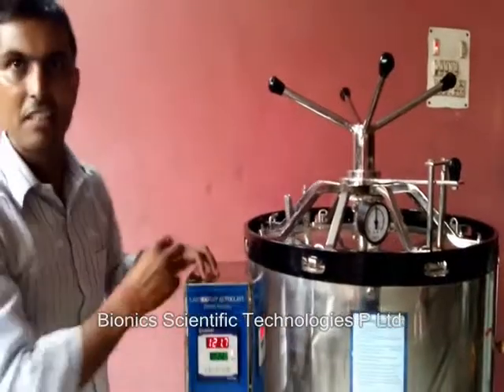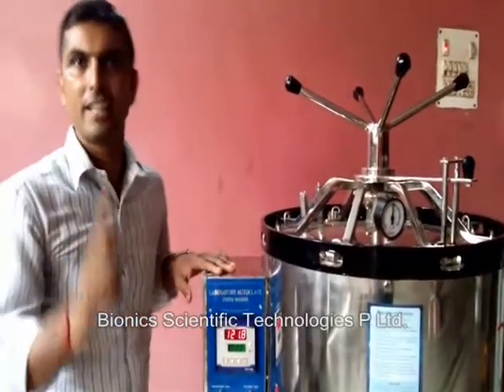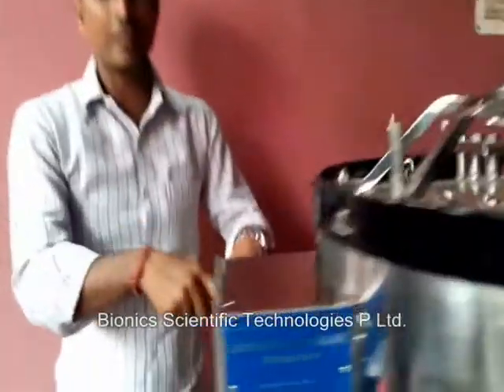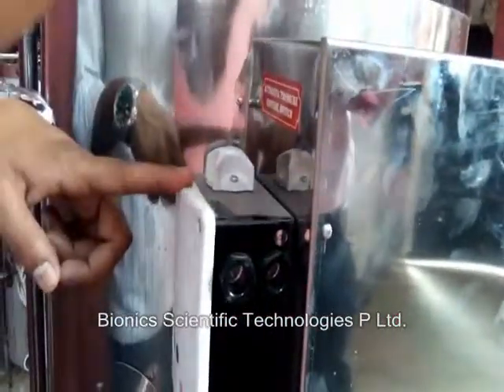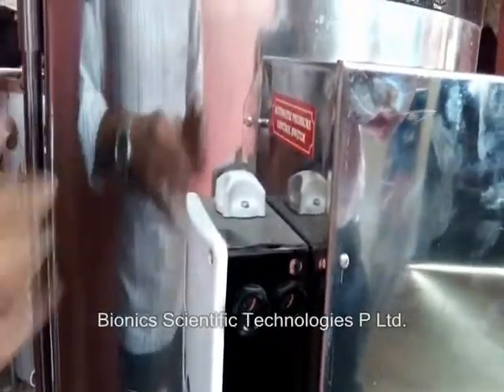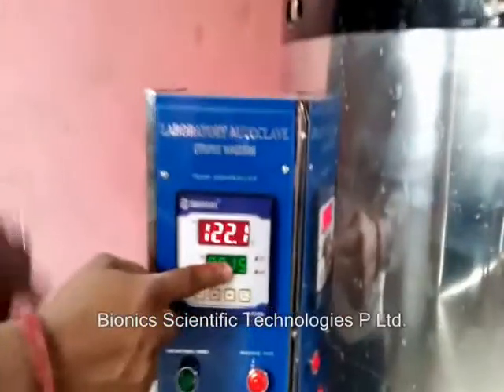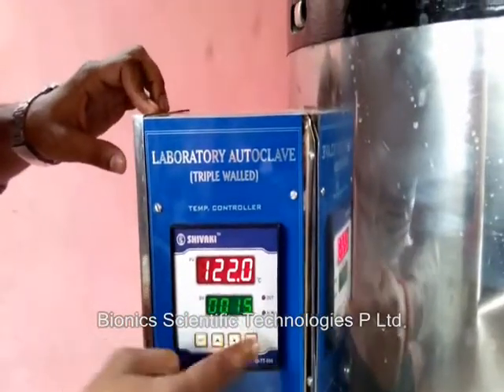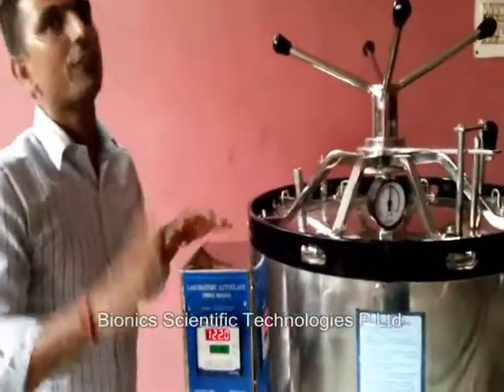Now we have achieved the standard temperature, standard pressure, and standard conditions. We have set an auto cutoff — it cannot go beyond 122 degrees Celsius. Here we have set a pressure cutoff beyond 20 PSI. This is a pressure cutoff device — it will automatically cut off the pressure when it goes beyond 15 PSI. Now you can see the timer has been started. The machine is at 122 degrees Celsius. It is 15 minutes; it will automatically shut down and the cycle will be finished after 15 minutes.